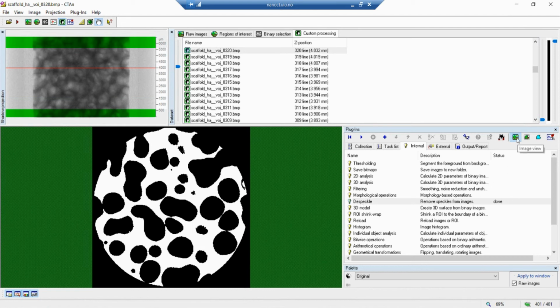It's important to get familiar with these 4 buttons here. This one is the image view. That's the one you're looking at now. The image the way it is now. It was applied some of the processes here. You see now it is like this. This is the image, and this is the image inside the region of interest, image inside the ROI, and this is the ROI, and this is a clipboard.